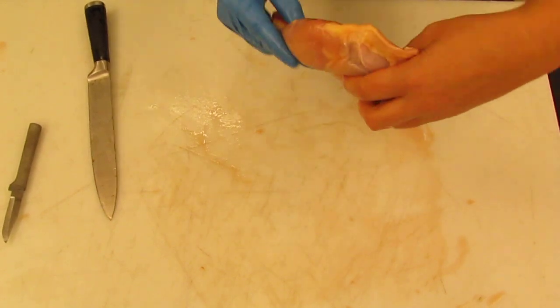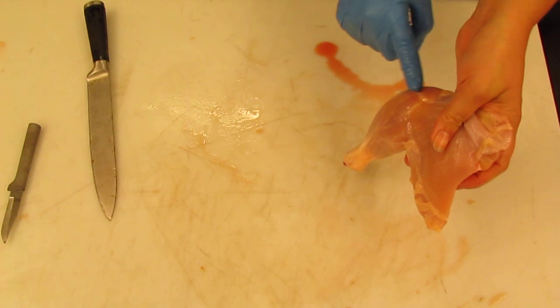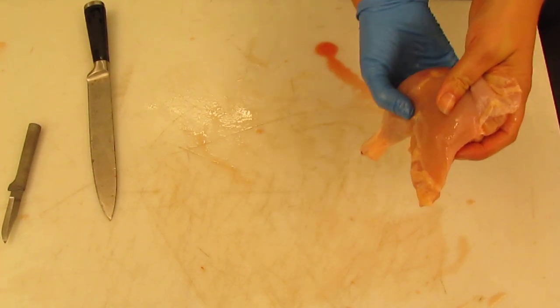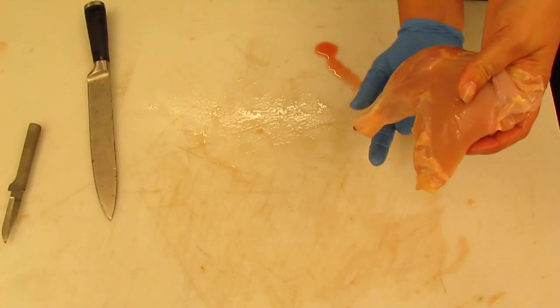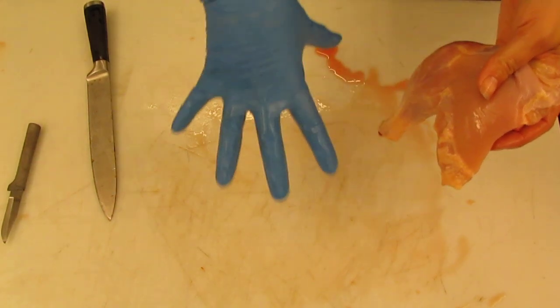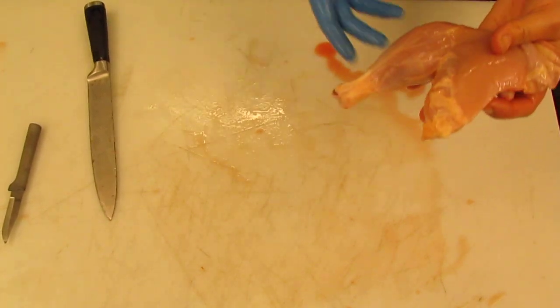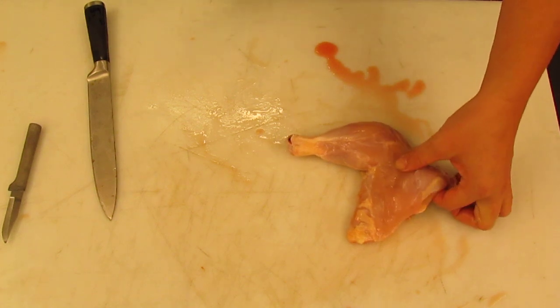okay? Finally, again, this is the knee, so the anterior side of the knee. On the posterior side is the gastrocnemius, and so this would have ultimately connected to the foot, which is what we would call the leg, of the chicken to allow it to kick backwards and run away. Okay, any questions so far? It's a little wild here.